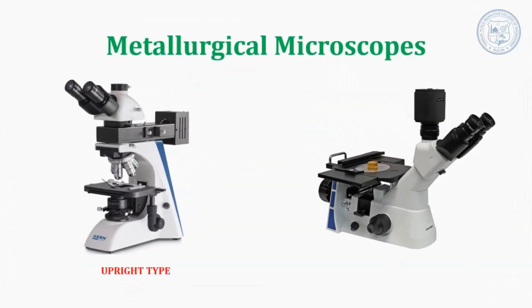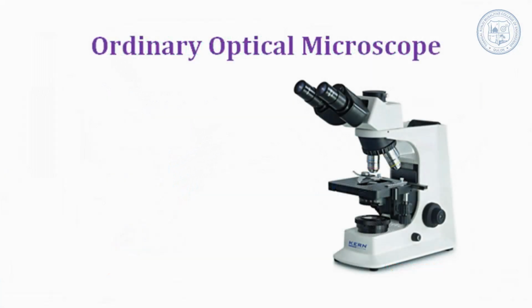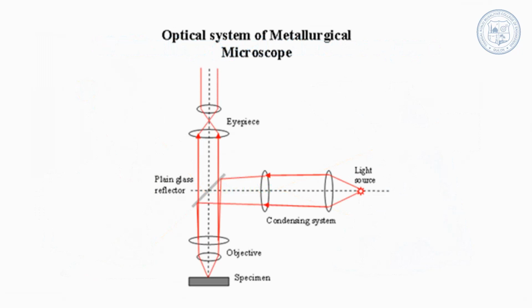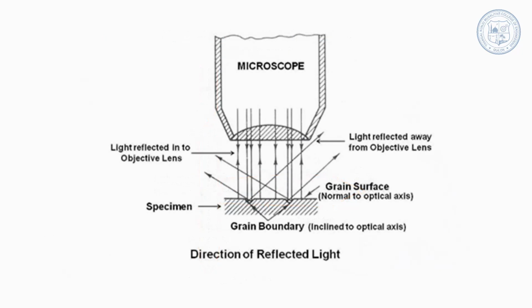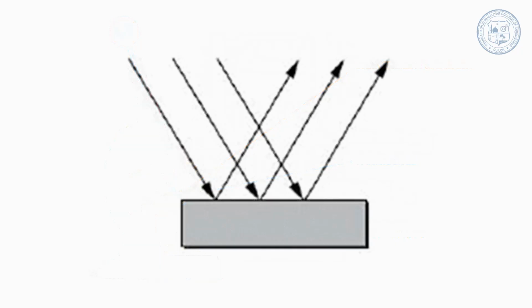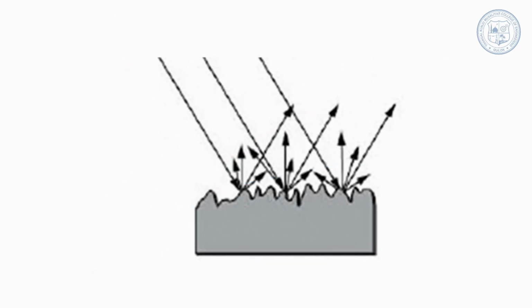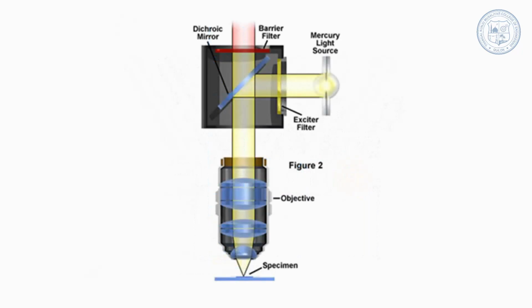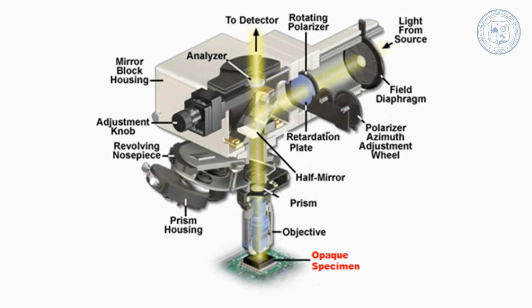A metallurgical microscope is like any other optical microscope with the exception of the lighting orientation. A metallurgical microscope uses a different lighting method that can illuminate solid specimens to identify, inspect, and measure them. A conventional microscope illuminates a transparent specimen from below the stage, making it visible through the eyepiece. Since light cannot penetrate opaque or solid objects, this is not a suitable method for observing these samples under magnification. Metallurgical microscopes illuminate objects using polarized light with an external light source.